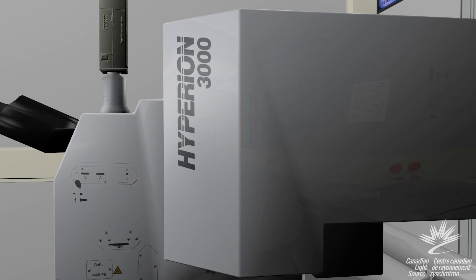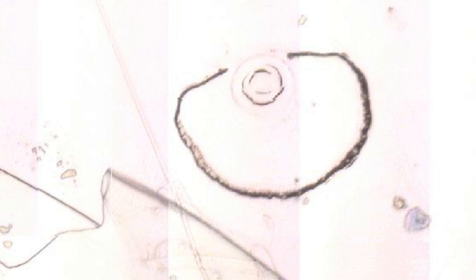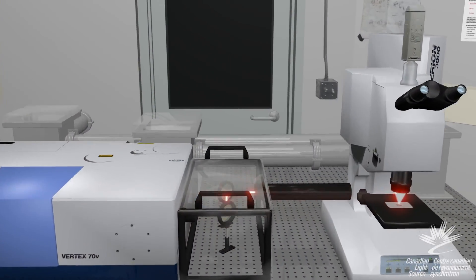The Hyperion 3000 is also equipped with a 64x64 pixel focal plane array detector, which allows 4096 spectra to be measured concurrently. This technology allows users to quickly collect data over large areas.